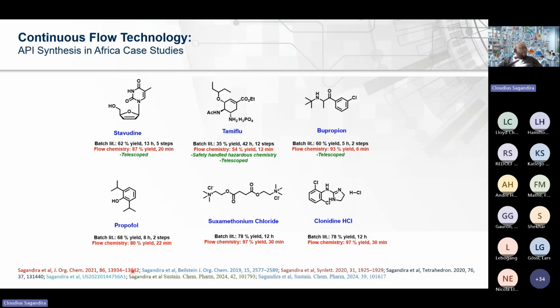And if I look at Propofol, we did a microwave reaction using Propofol in 22 minutes. Recent work that we did with clonidine, this one is under review. We also reduced the time to 30 minutes, and these are all the references to the work.